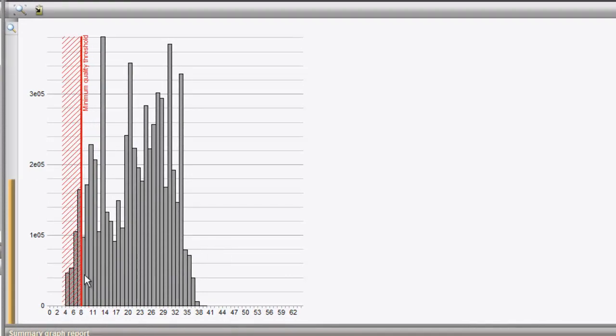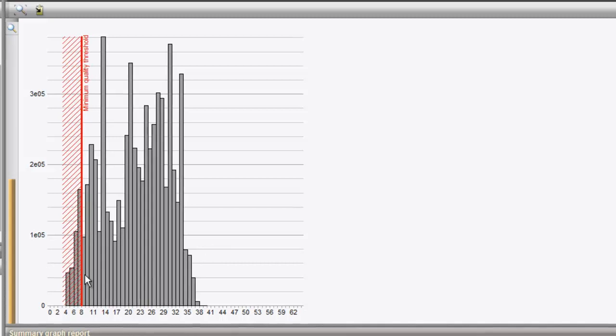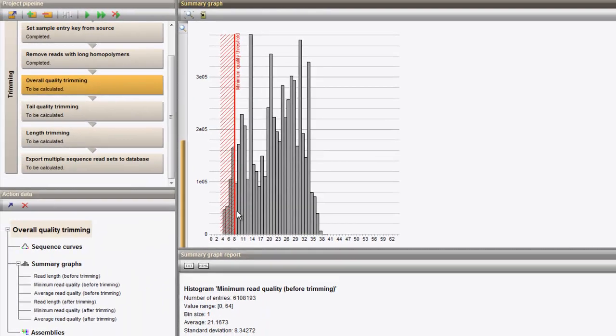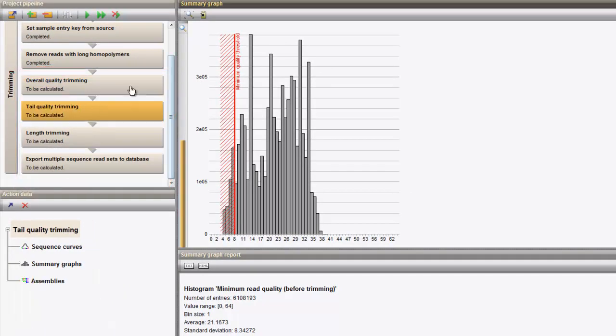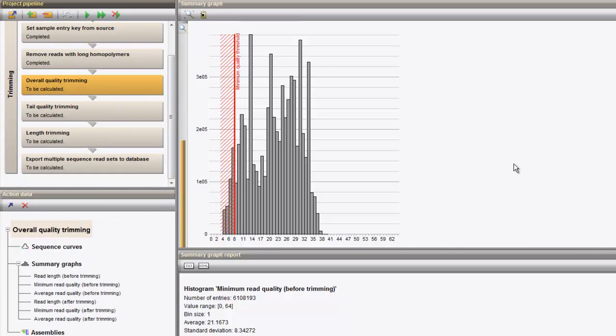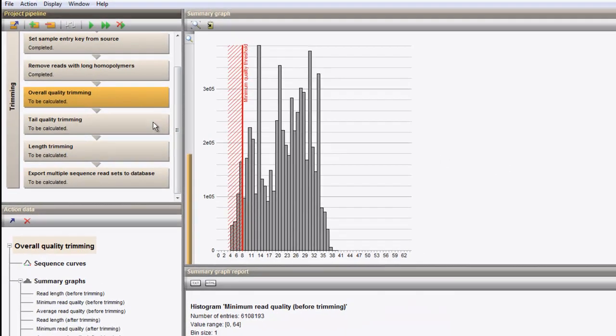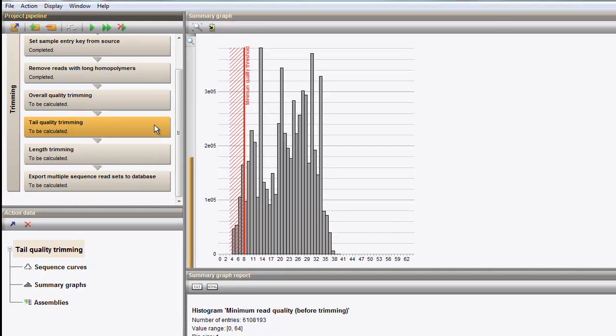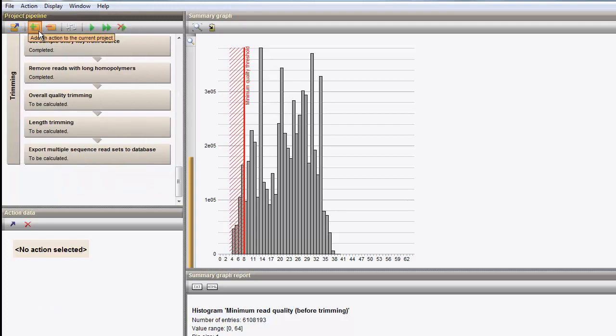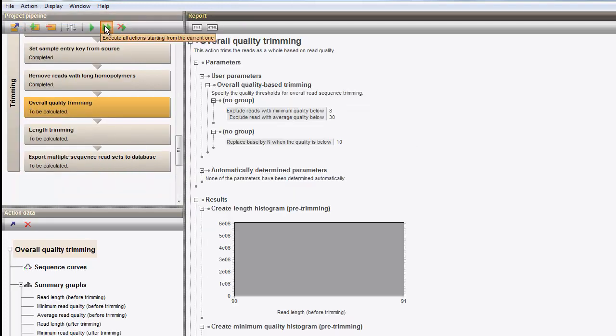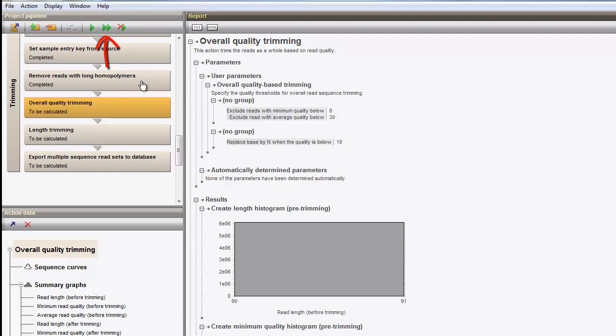This way, the trimming parameter is updated and all action states change from completed to to be calculated. To exclude a specific action, I select the action and I choose Action Remove Action to remove it from the pipeline. I can now rerun the analysis with this button and save the updated dataset to the database.